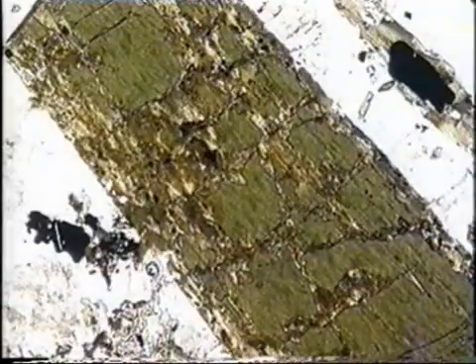Hornblende can react or alter to biotite, and can alter to a colourless or pale green uralitic amphibole. This is a calcite chlorite pseudomorph of hornblende.